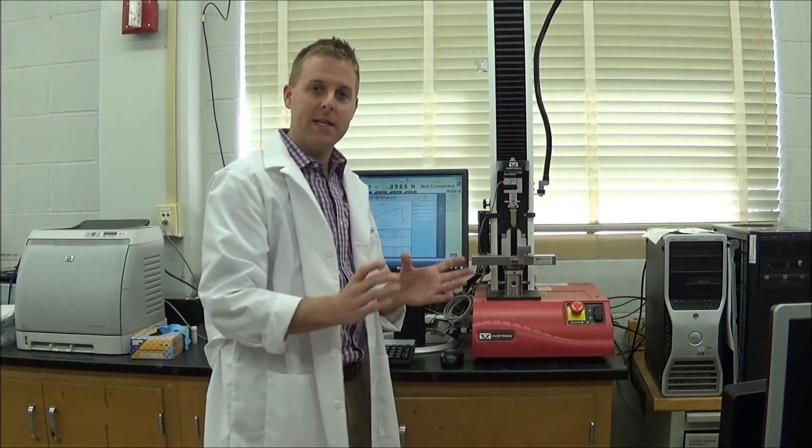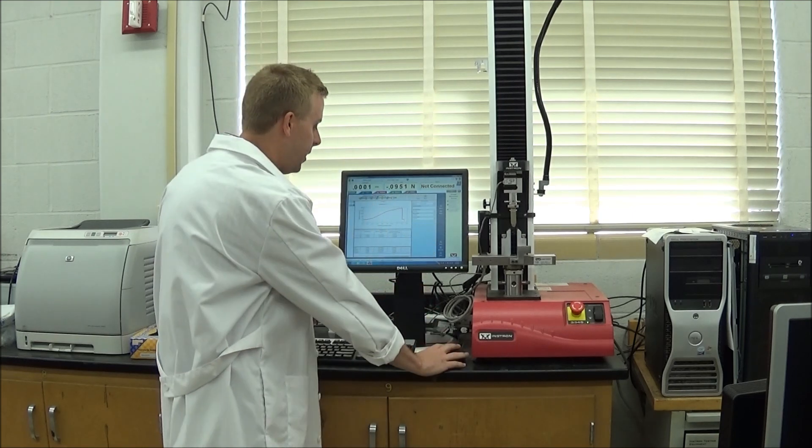So I'll leave you in this video with a challenge. We know the span length of this fixture is 18 millimeters. And we know from the machine here that the maximum force was about 204 newtons. It gives us this readout right here. So 204 newtons is what this thing experienced.